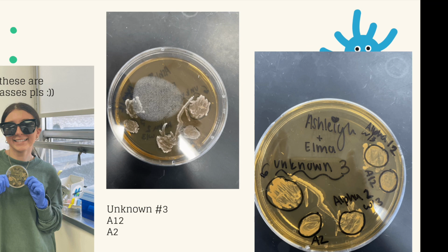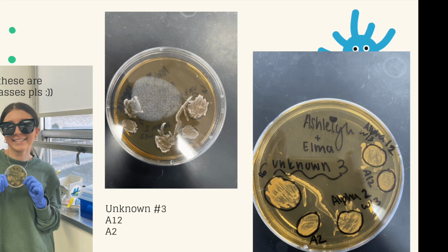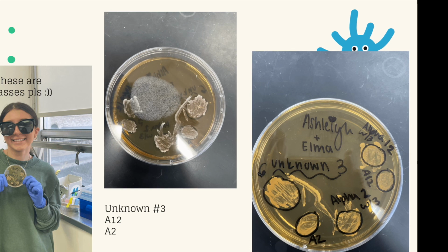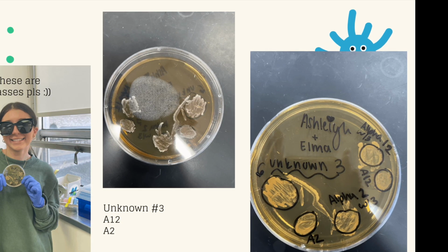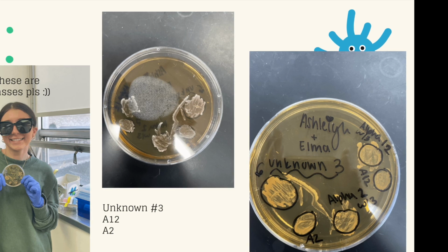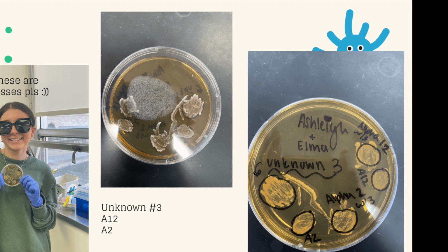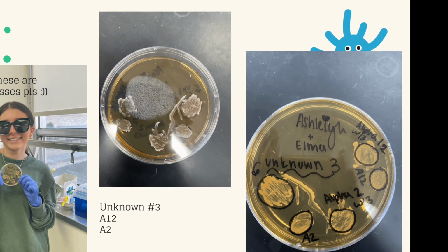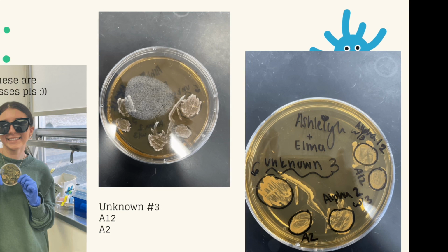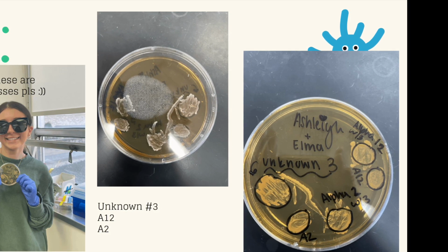and repeated the process with other bacteria samples. Here in this picture, you can see Elma with her very proper safety gear on, and our agar plate after basically 2 weeks, I think it ended up being, or a week and a half, something along those lines, some extra time to incubate. You can really see in the picture on the far right, our unknown sample is kind of all over the place, and our alpha isolated and mixed with our unknown.